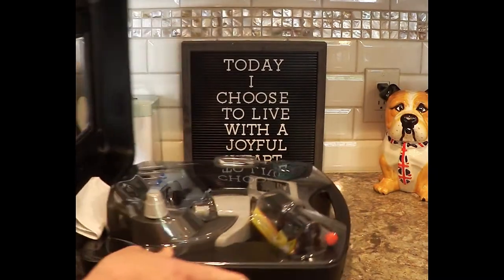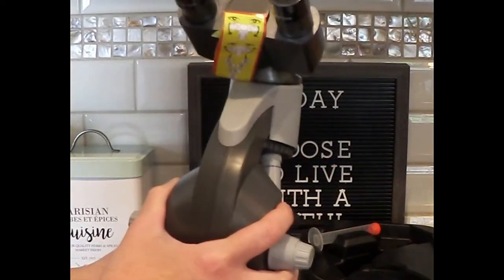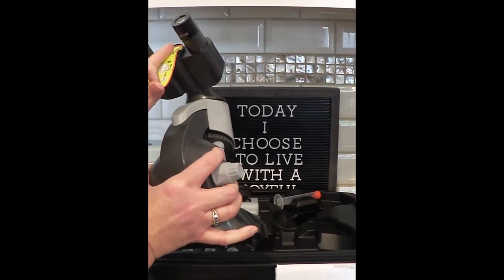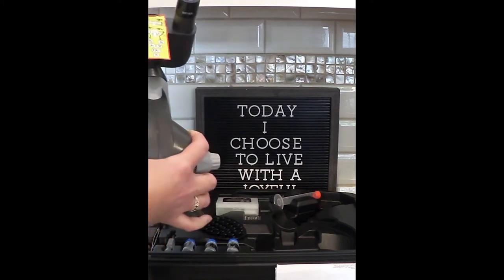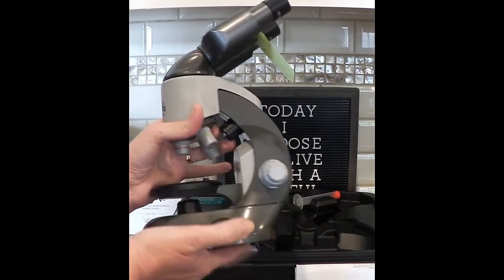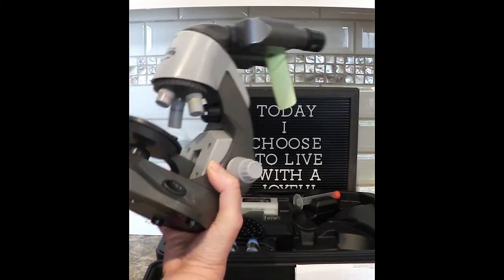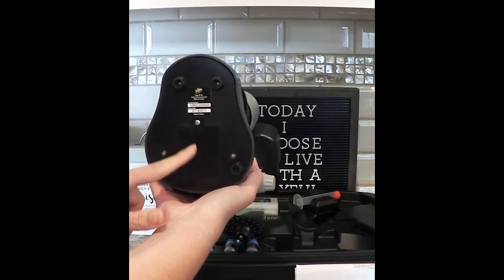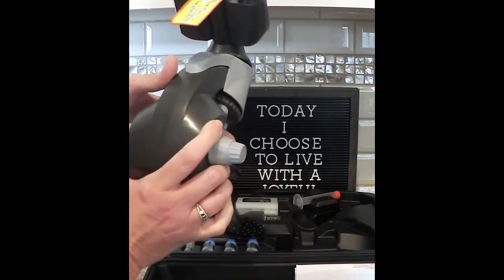Case open. The microscope. We've got an on and off button here. We can turn the magnification around. It's made out of plastic. The bottom feels like it's metal. It does say EduScience on the front. It does need batteries, which go in here — I believe they're AA. So that's the microscope itself.